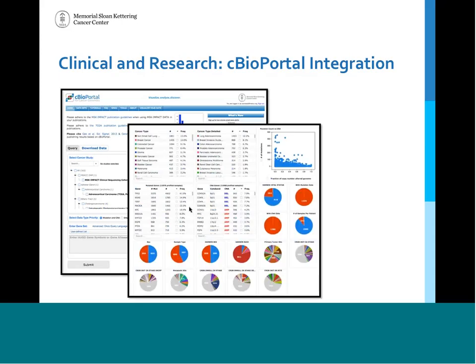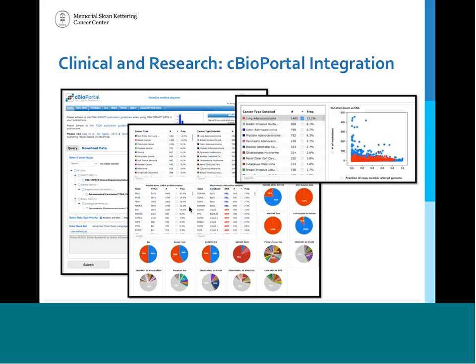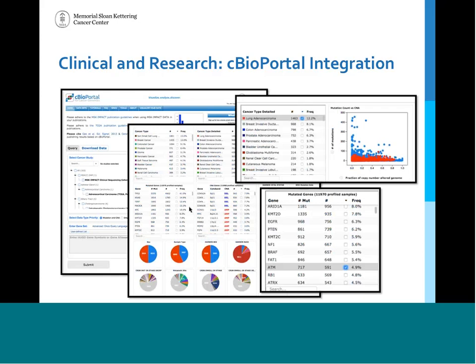So we can then query the system based on projects, or based on different cancer types or mutation types. So based on how well the investigator has provided us with information up front, we can make this very integrated and very advanced place for anyone to come and query information about different tumor types, different mutation types, different cancer projects or studies. We have TCGA data, but this is our ending point of where the LIMS finishes depositing all of the information.